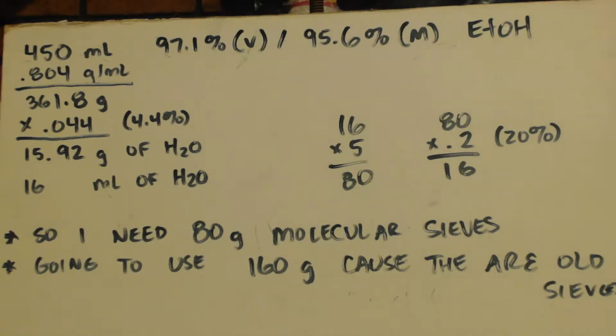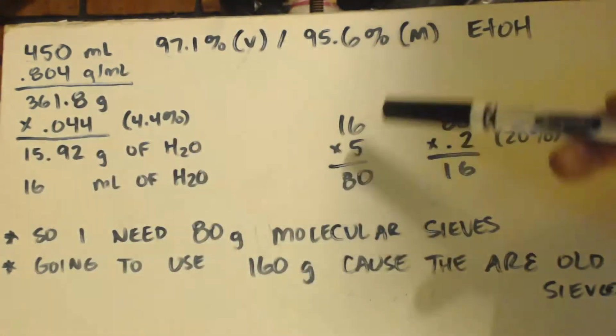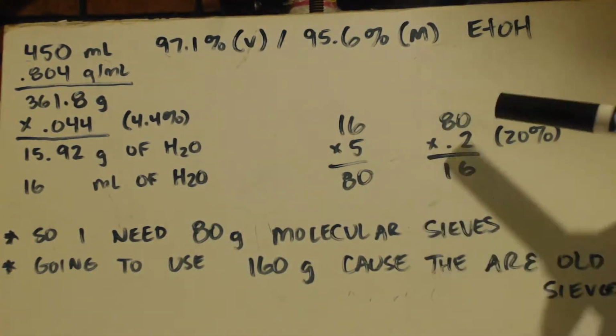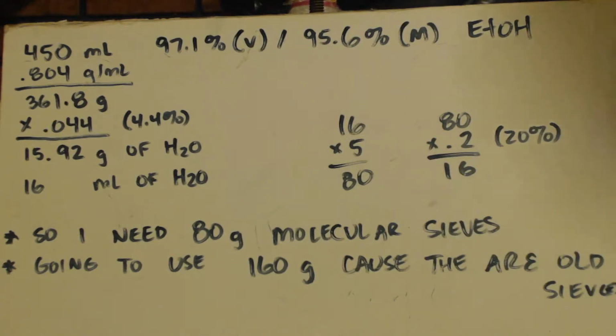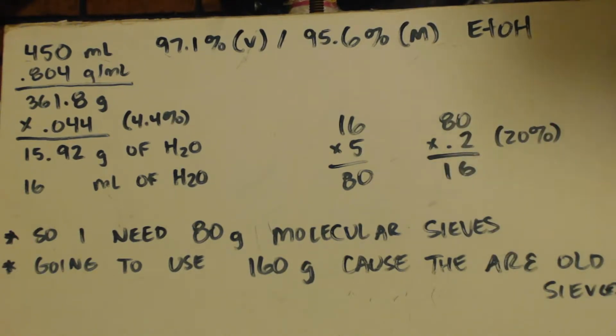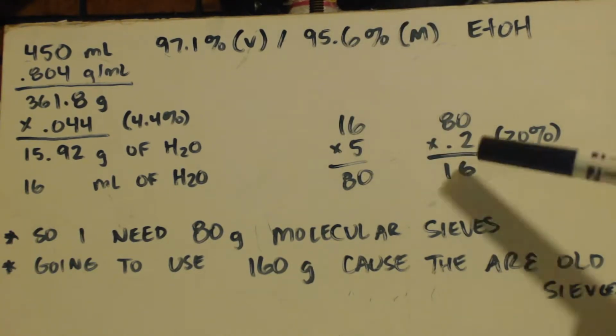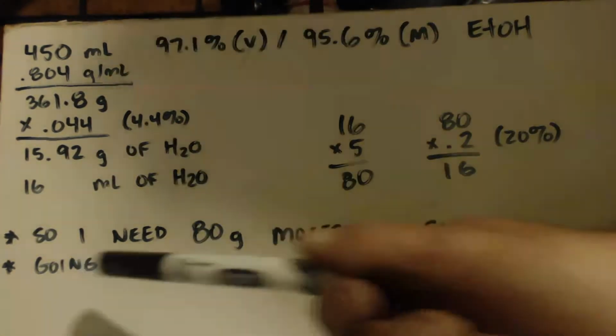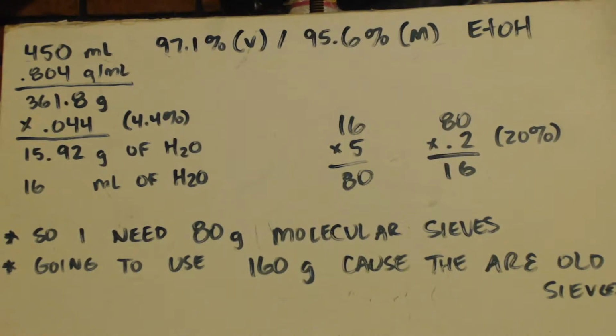Molecular sieves, in general, if they're good, should be able to absorb 1/5 of their weight, right? So I took this 16 milliliters and I times it by 5 to get 80, okay? Just to make sure, I took 80 times 20%, because they can soak up 20% of their mass, is 16. So 80 grams of good molecular sieves will soak up 16 milliliters of water, and that's what we got, right? So I need to add 80 grams of molecular sieves.